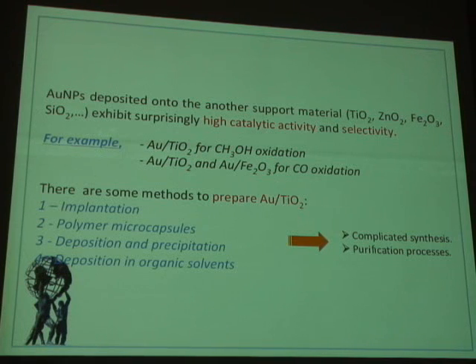We can prepare by implantation, polymer microcapsule, or deposition and precipitation, and deposition in organic solvent. All other methods are complicated synthesis, and some need purification processes after preparation. Because with gold nanoparticle covering the titanium, and gold has the selectivity and easy conjugation with the biomolecular, we predict that gold cover titanium can be used for IVD testing.